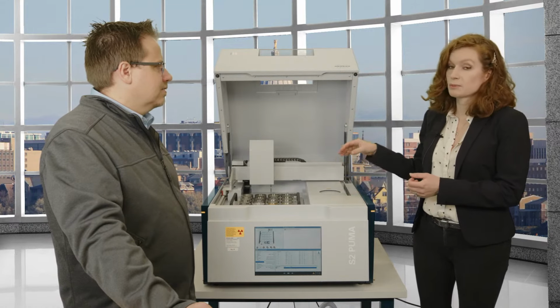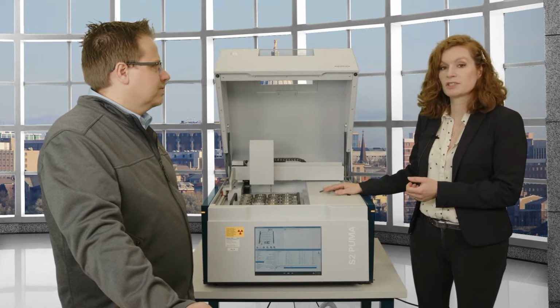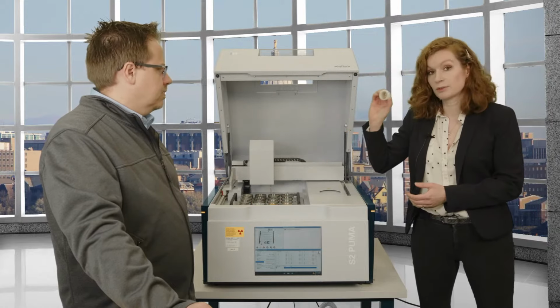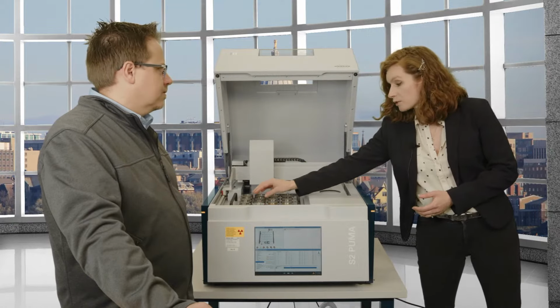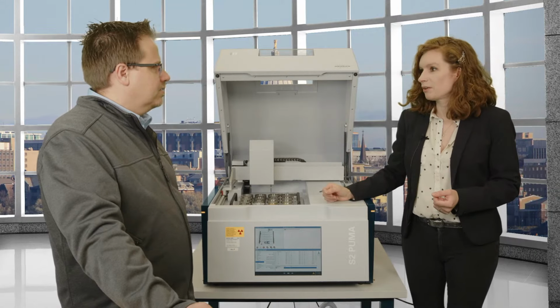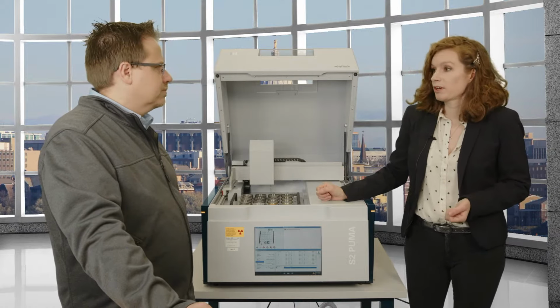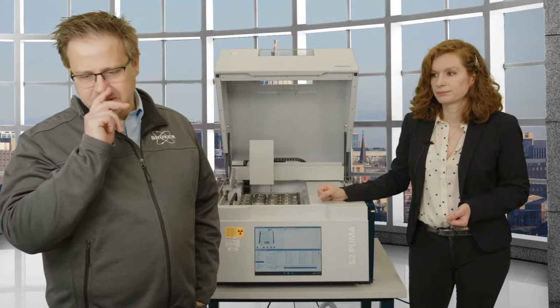And then when we get to EDXRF, we right now have the system with the silver tube and the specific detector for light elements, but we do have a standard model too, right? I'm talking about feed and food, but people who do mining or jewelry do not care about the sodium. In fact, the sodium that we would have measured off of this is me touching it, right? So for that, a standard detector and a standard tube, which would be our palladium tube, is fine.